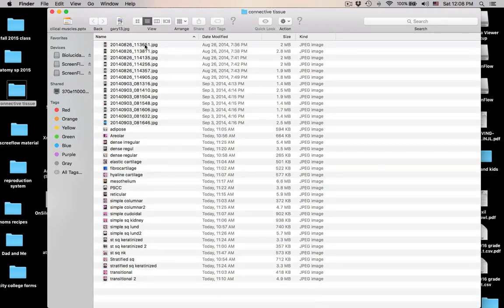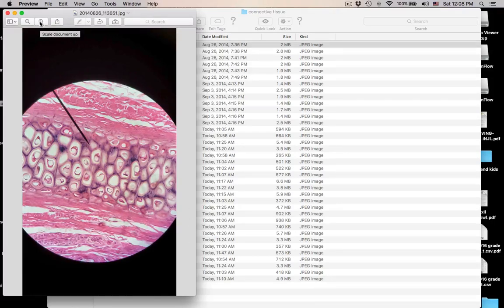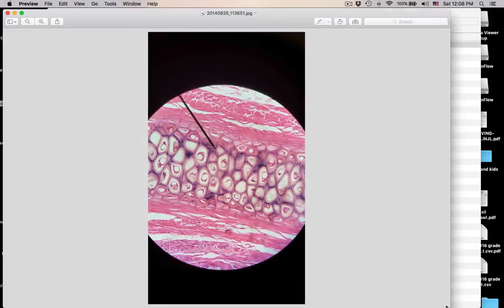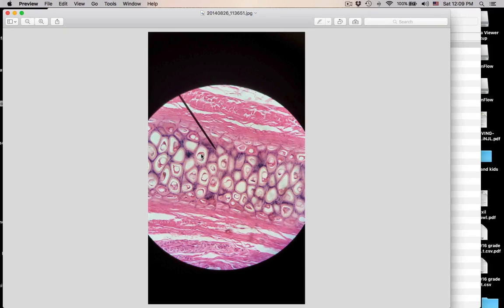Let's pop some slides up. First thing you should notice are these white things — these are lacunae. Lacunae is plural; singular is lacuna. In the lacunae are going to be our cells that make this matrix. These are the chondrocytes. Chondro means cartilage, so as soon as you see lacunae, you know this is some type of cartilage.